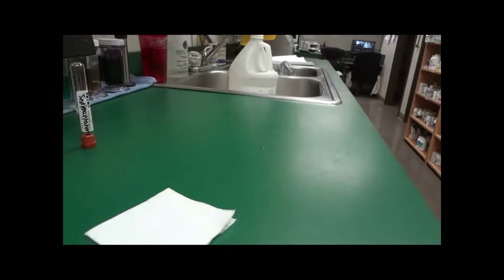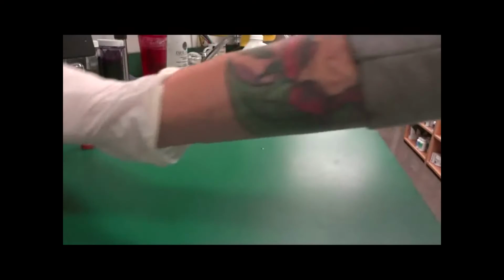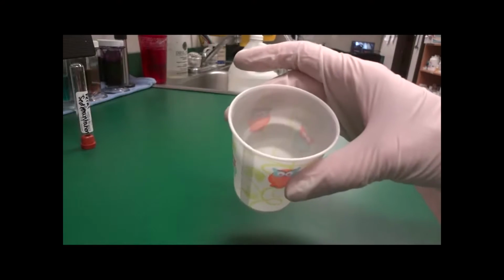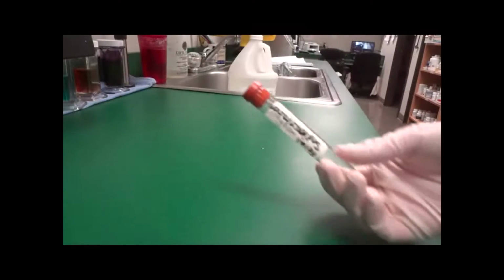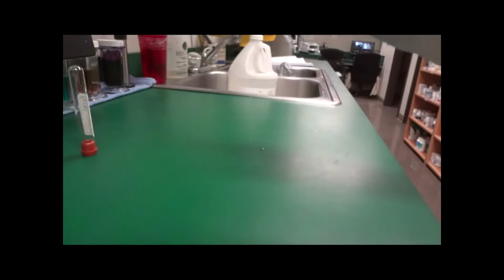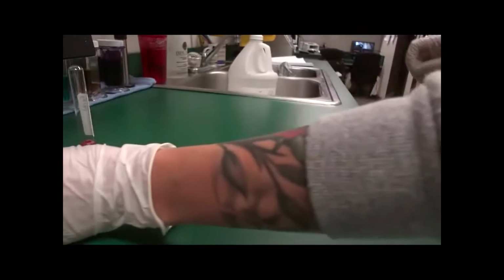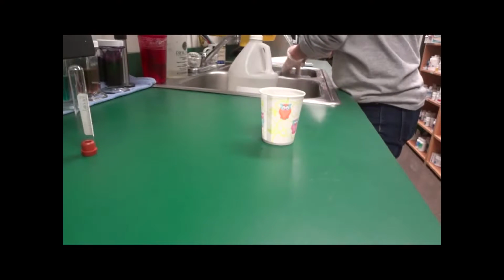Alright, next we're going to be showing how to run a fecal with sedimentation. We've got our dry gauze, our cup to mix the sample with, and our tube that the sample will eventually go into. So, to start, we will need 2 grams of our sample of feces.